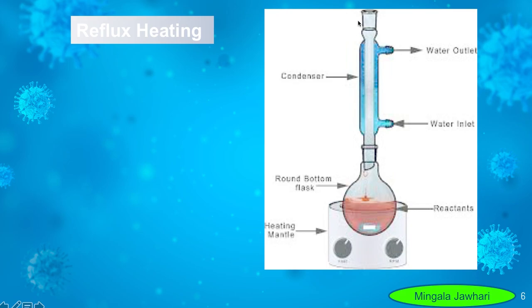The condenser should not be sealed or closed from the top, to avoid pressure buildup. Okay, so this setup you should know clearly. Always water comes from the lower part to cool the gases, not from the upper part.